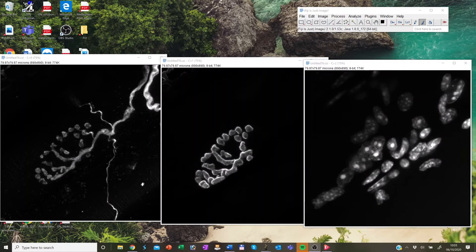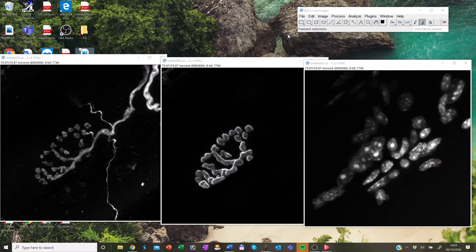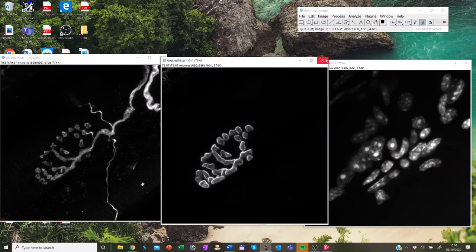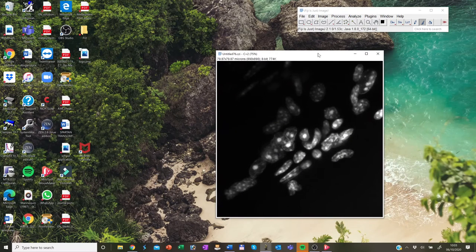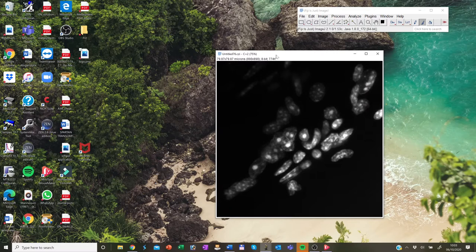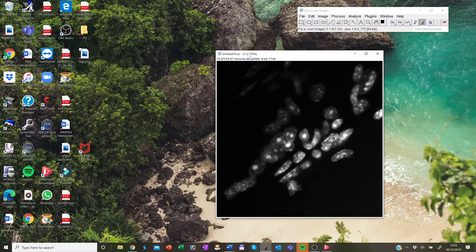Whenever you open up an image, be it like file open or open samples or with a drag and drop, the image will open up an image window as you can see down here. Let me just close two of them and have this one here.